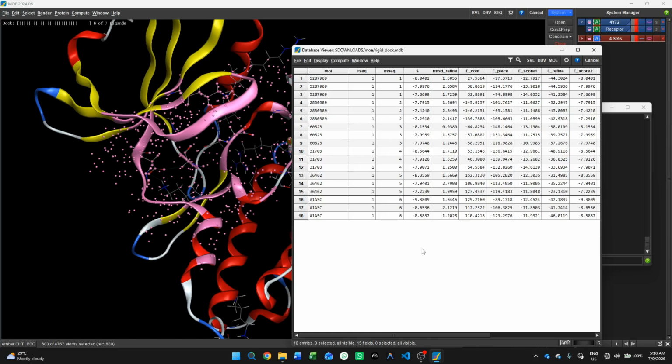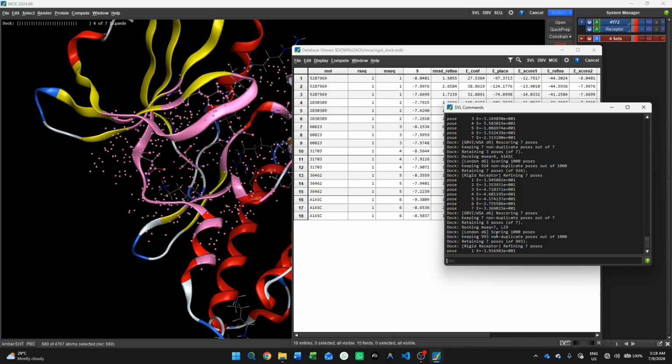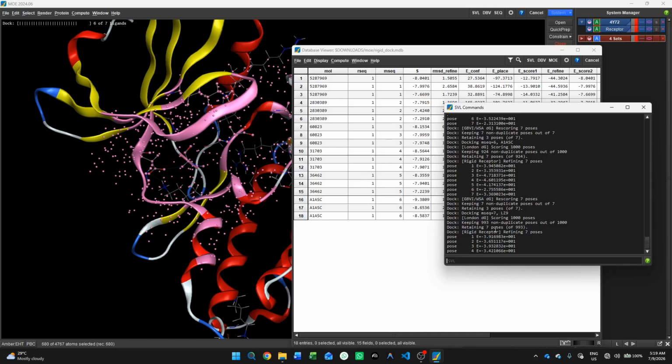So we have 6 out of 7 done. Surprisingly, this one that does not really look like a co-crystallized ligand has a very high energy, while the others are all very low energy. I think the last one, LZ9, is a co-crystallized ligand, and it has started. So we'll work together with this and see how it binds, since we are basically redocking it.